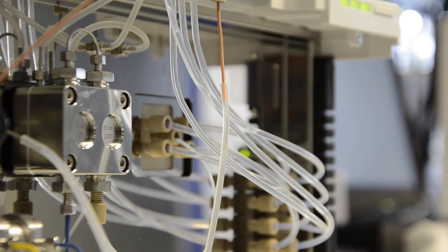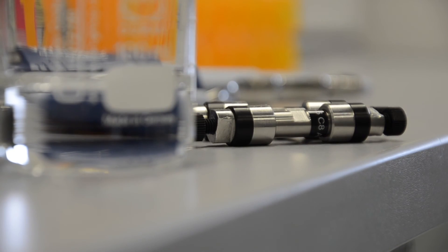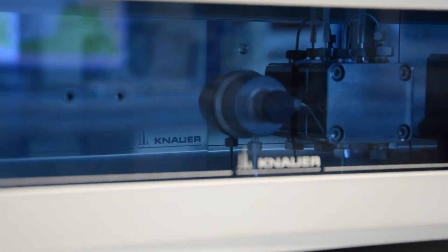The sugar purification system is a really simple system. You have one system consisting of one injection valve, one pump, and one fractionation valve, plus a refractive index detector. The system may also be used for other purification tasks if you use another detector, or you can use the refractive index detector for analytical purposes.